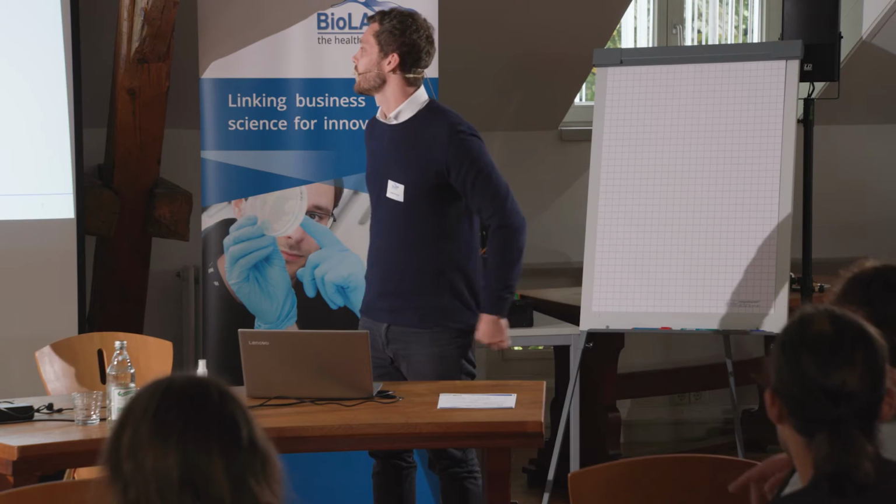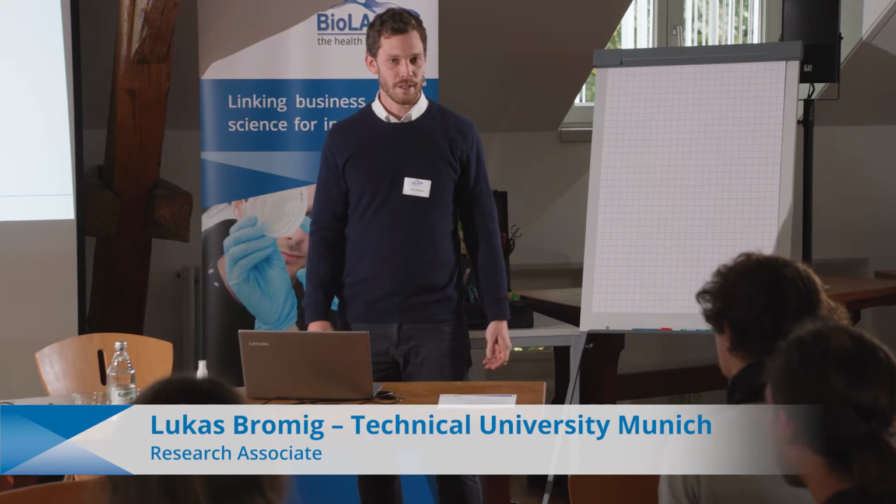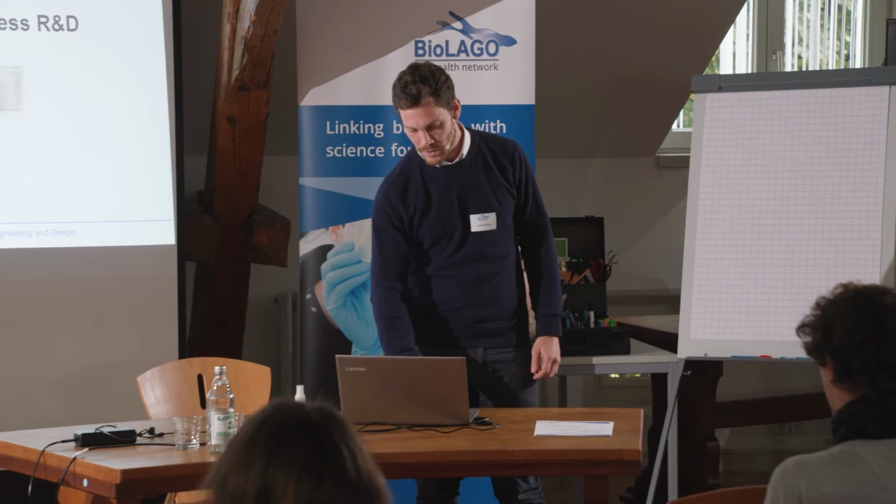All right, so the enabler for accelerated bioprocess R&D. How do we use SiLA at our chair, and what were the benefits? Like, what is our story?